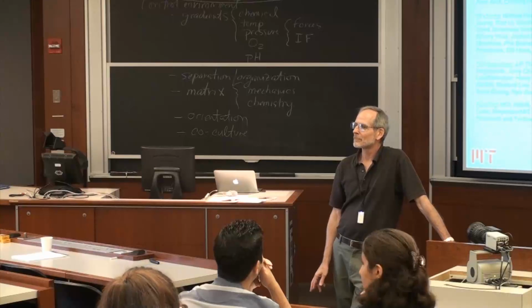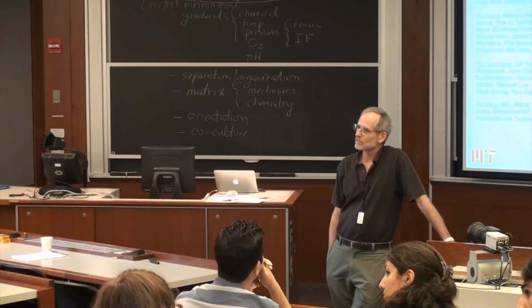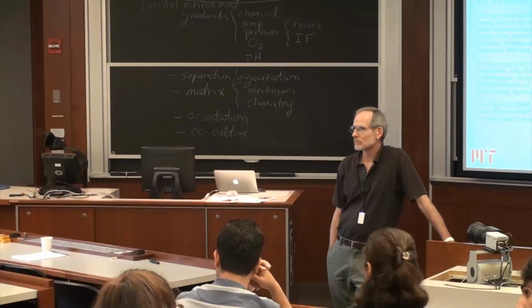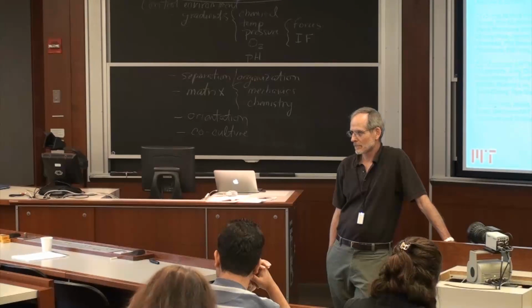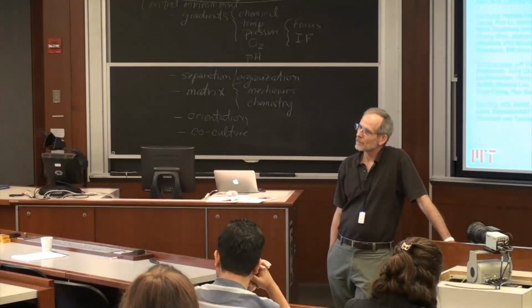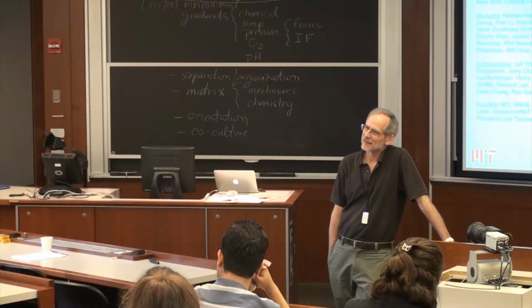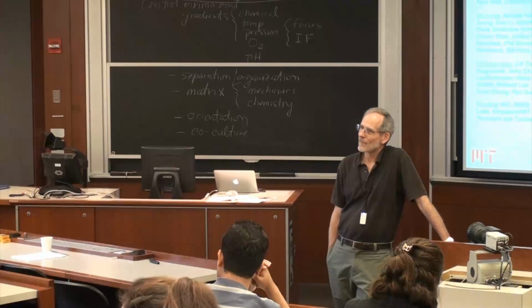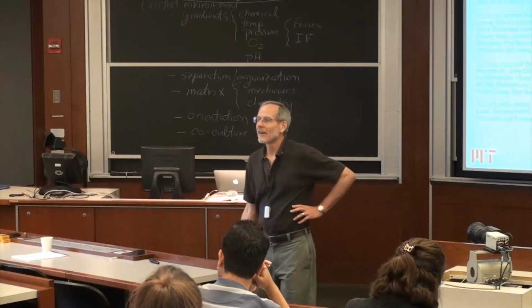I just want to add another experiment talking about microfluidics. In 2005 in Nature there was an experiment on microfluidics. One embryo is kept, and from two sides two fluids were flown at different temperature. Embryo development processes are very sensitive to temperature, how slow and how fast it happens. And it was observed that in the part which is warmer, the embryo development happens much faster than the other part. But after some time, that part gets stalled, so that this part also catches up to that stage, and then embryo development happens normally.